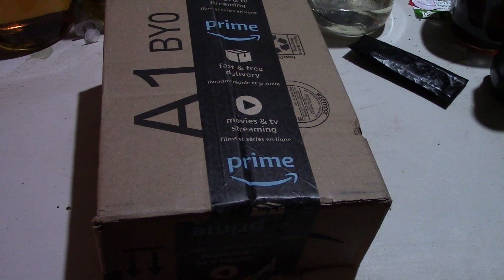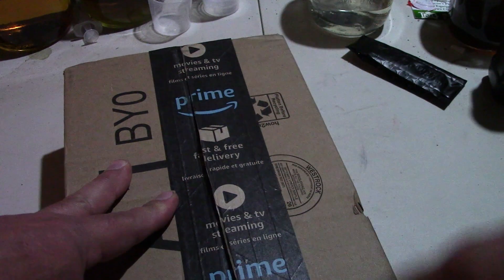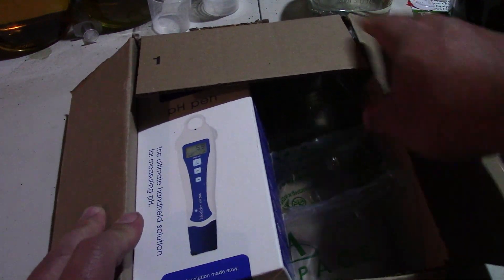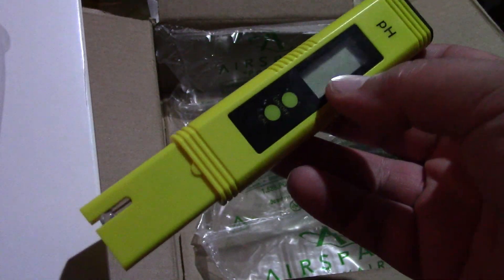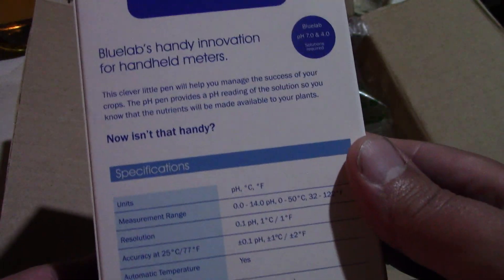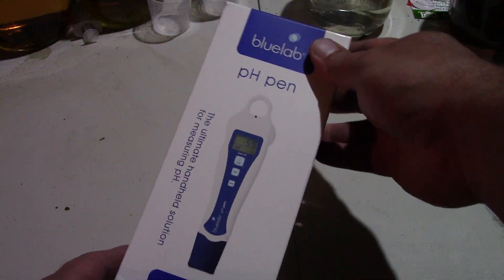420 things grow in Ontario. Back with another unboxing. This will be one of the first items I've gotten off Amazon in a minute. So you've seen this cheapo beepo that I got - I've already ordered another one. This one came with a PPM meter and a pH pen and it was like 30 bucks. I bought this one - it's quite expensive but apparently it's supposed to be pretty good. I've ordered a second one as well in the price range of over 120 dollars. Let's take a peek at this one.